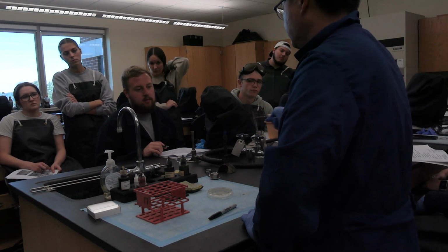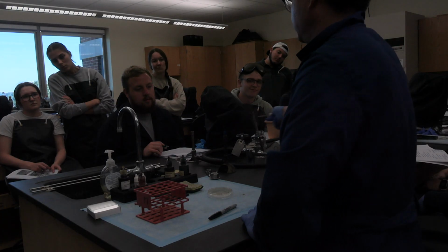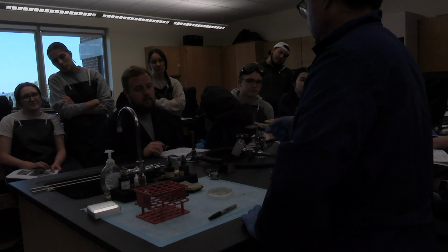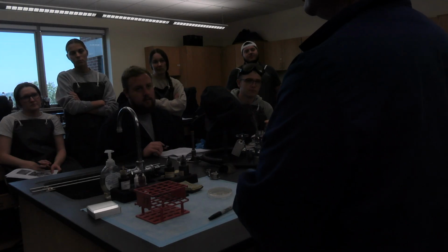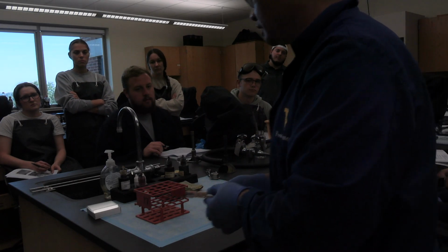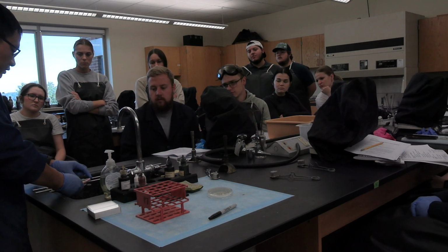Back and forth, a couple of times. This is called heat fixing, but not cooking. You have to do it evenly. Make sure you don't burn yourself. Back a couple of times. So it's ready. Cool down a little bit. It's very hot. Don't touch it right now. That's why it's important that you have gloves ready. Okay, now go here, a little bit close. Put it right here.